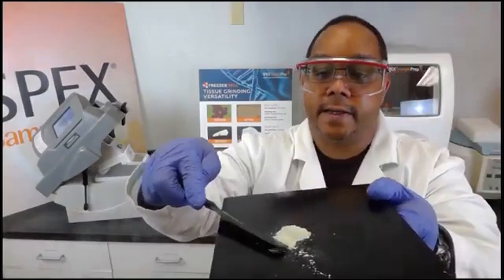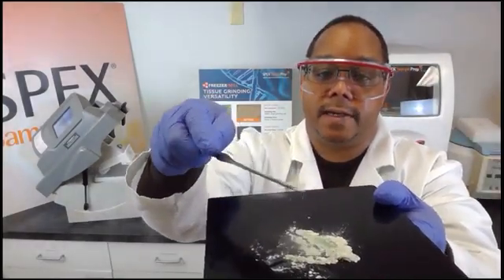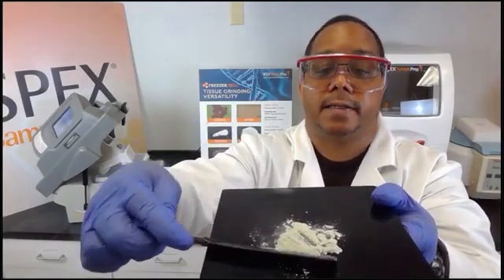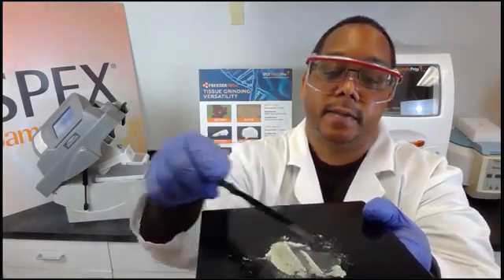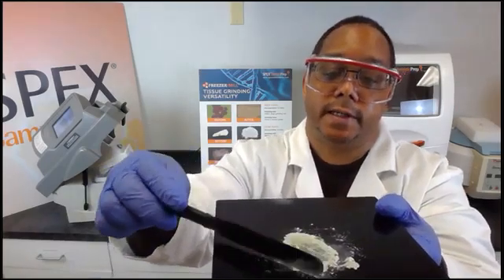So as we can see, the sample was completely pulverized to a powder form. At this point, the sample could be analyzed through acid dissolution, either by ICP method, atomic absorption, or GC.